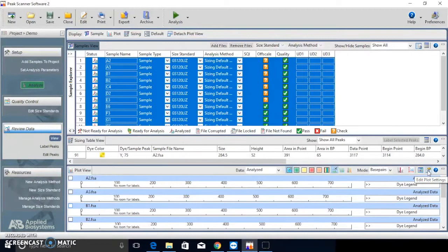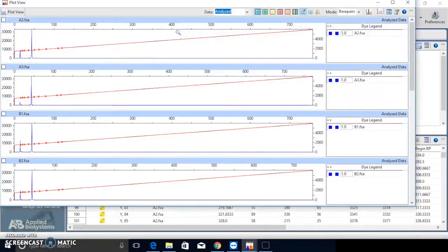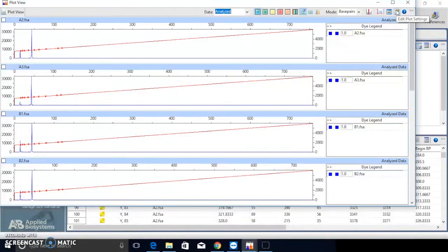You can edit plot settings through the button here, or you can access the same button through Detach Plot View. I will use Detach Plot View as an example in this tutorial.